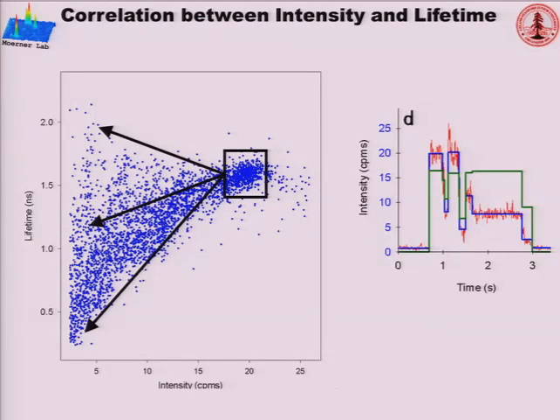of points here with high intensity and high lifetime, but only after repeated photoexcitation do we start accessing this broad analog distribution of lifetimes and intensities. Well, that's interesting. Right? I then realized that I'm not so interested in these points themselves. I'm interested in the transitions between those points.